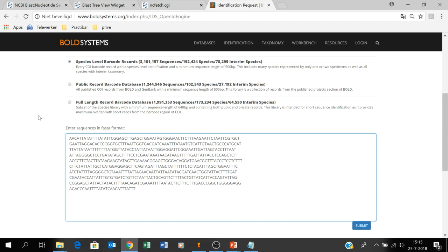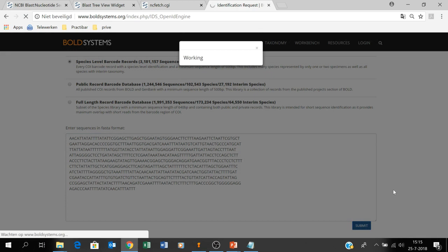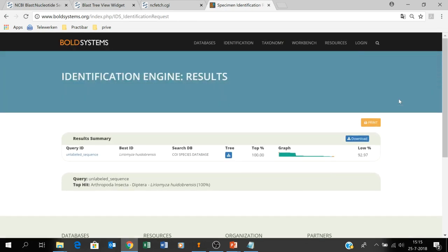If the sequence is in the other direction — reverse complement — you will get no output, or you get output from a totally different organism. So be aware of that. We submit the sequence and have to wait a few seconds, sometimes a little longer depending on how busy the website is.